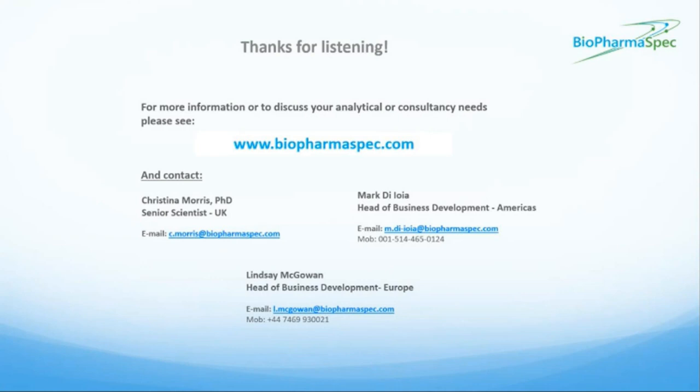So MS does have incredible dynamic range. It can detect low levels of HCPs amongst the high drug product, but you can still have suppression of peptides of interest, or as I said, ionization inefficiencies, or perhaps you've got incomplete digestion or other interferences, which is why we always recommend using different methods to prevent any HCP oversights.